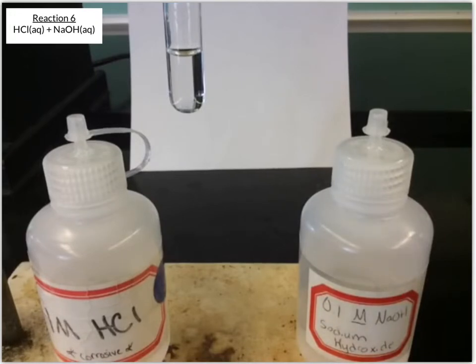Okay, so we started with 2 clear colorless solutions. We still have a clear colorless solution, and if I stir that, see, it's still clear and colorless. And so just by outward appearance, it doesn't really look like anything happened.